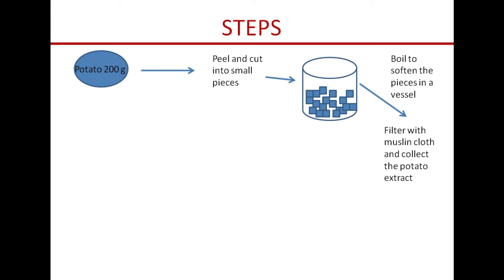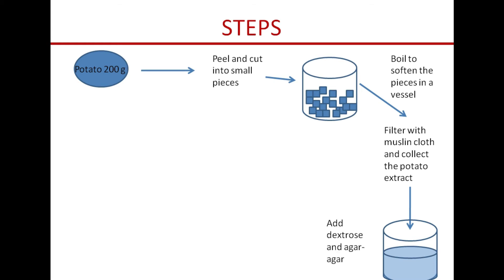After the pieces are soft enough, we filter with muslin cloth and collect the potato extract, discarding the potato pieces. To this extract we add dextrose and agar agar - if we are making one liter of PDA medium, 20 gram of dextrose and 20 gram of agar agar will be added.